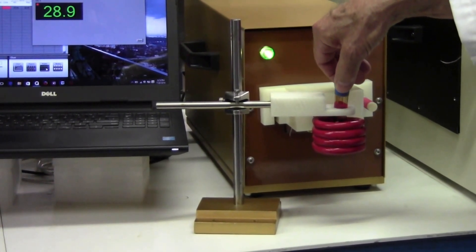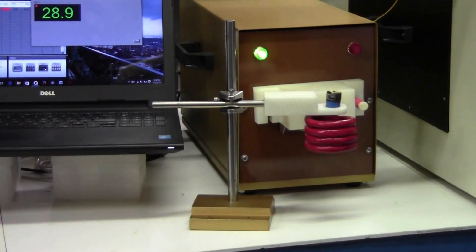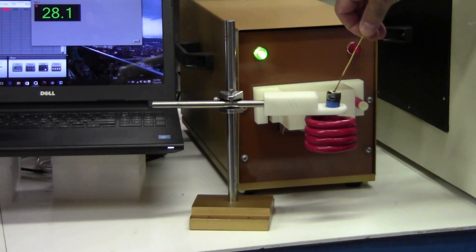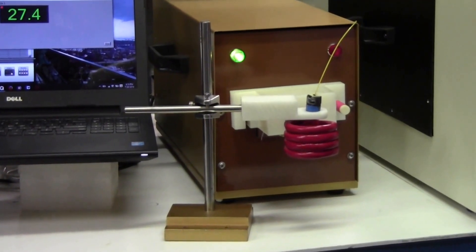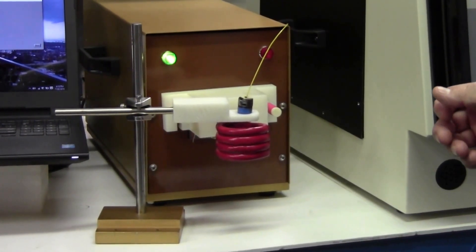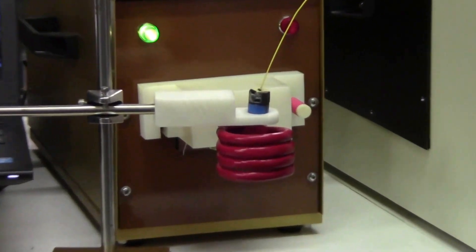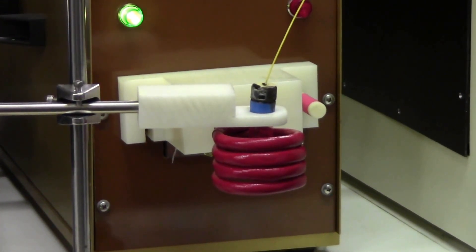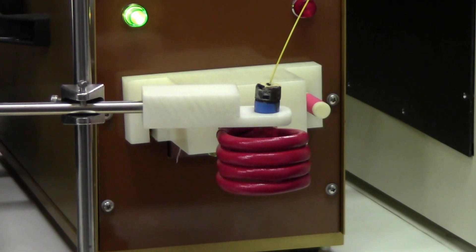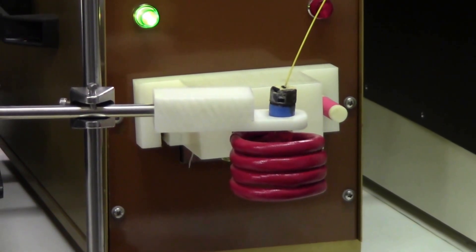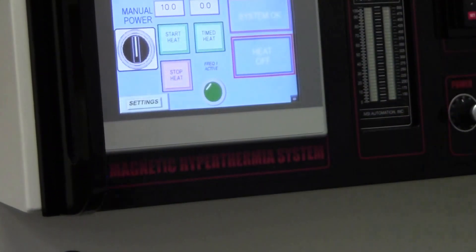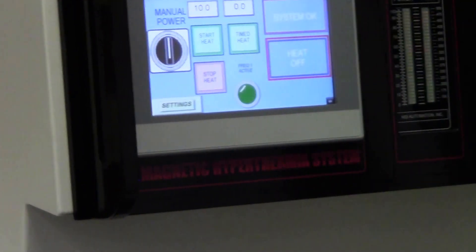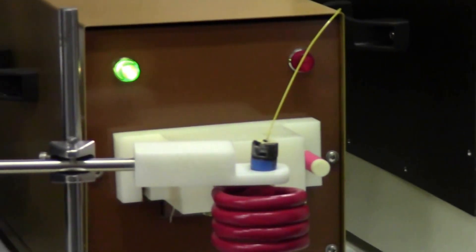Because when you're heating with this type of machine, there's no noise, yet at the same time you may have five or seven kilowatts of energy inside the heating coil. Now you'll notice we have a test tube here with nanoparticles in it, and then we have a fiber optic cable. So I'm going to insert the fiber optic cable into the nanoparticles, which is a solution, and we will do some manual heating. I can control the heating from the keyboard, or I have a foot switch as well.